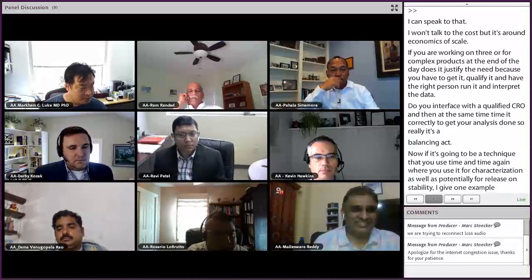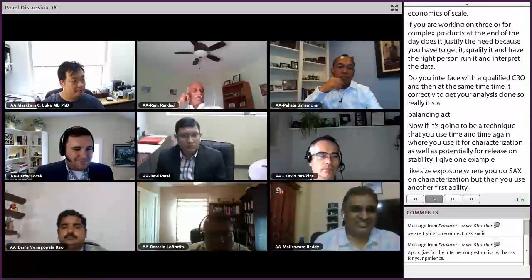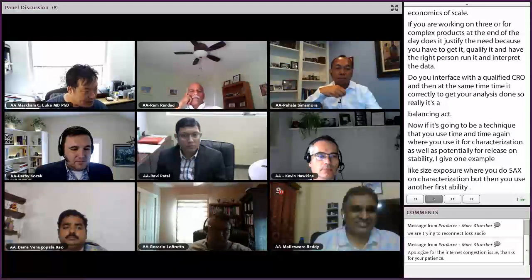But for something like AUC or SACS, or even more challenging SANS, that's something maybe where a CRO might be more appropriate. Excellent, excellent. Thank you for that response. Does anyone else want to respond to that question?